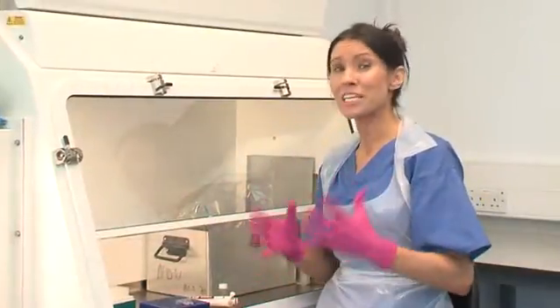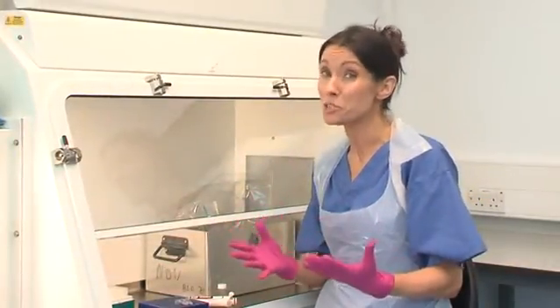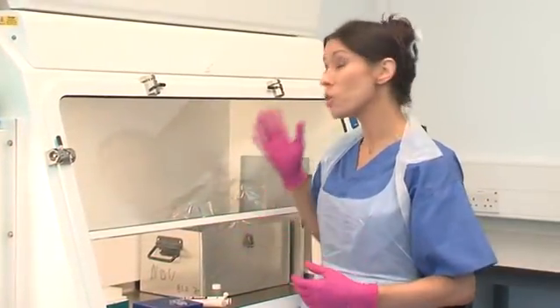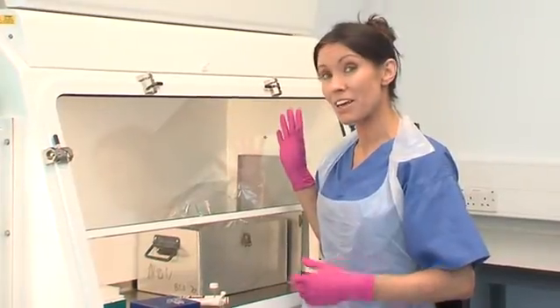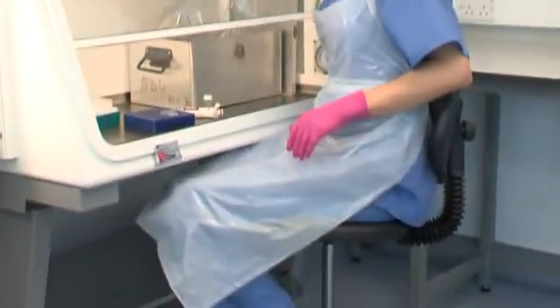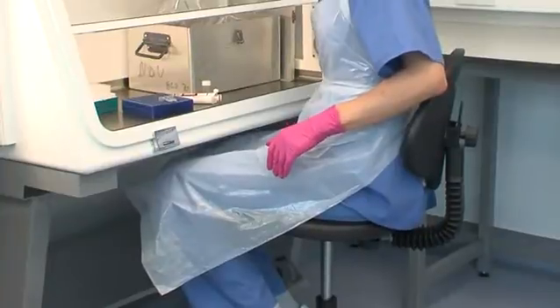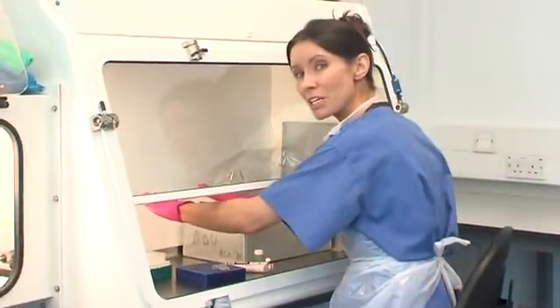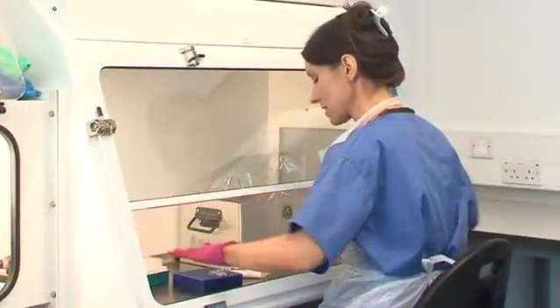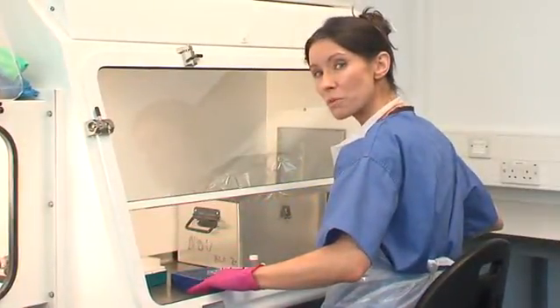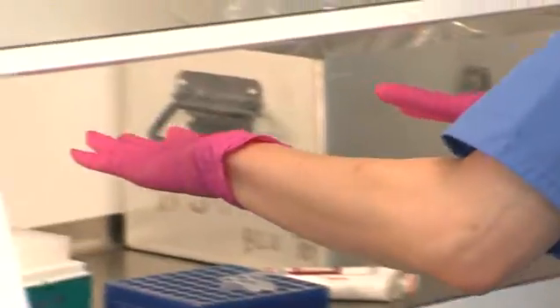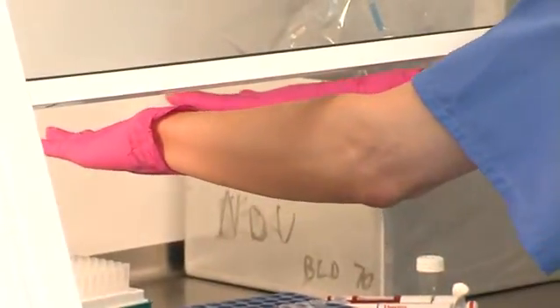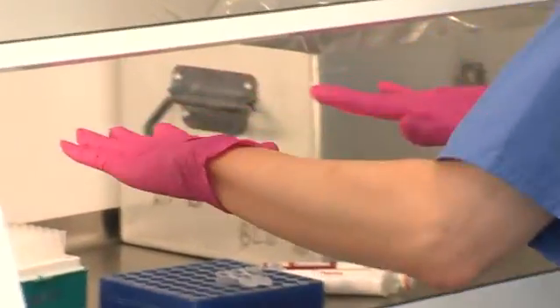For both safety and comfort it's important to adopt the correct posture when working at a safety cabinet. The chair should be adjusted to ensure maximum comfort with your arms placed well into the cabinet, not right on the edge. Your arms should be moved slowly to maintain the correct air inflow when moving them into and out of the cabinets.